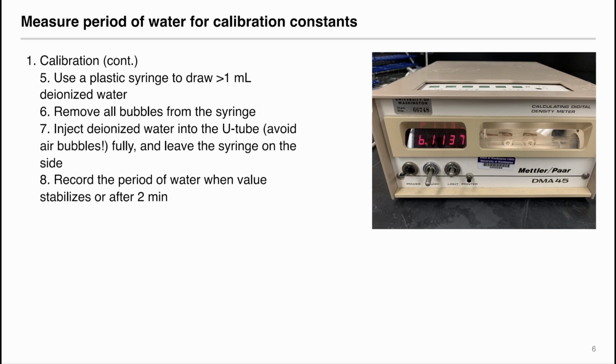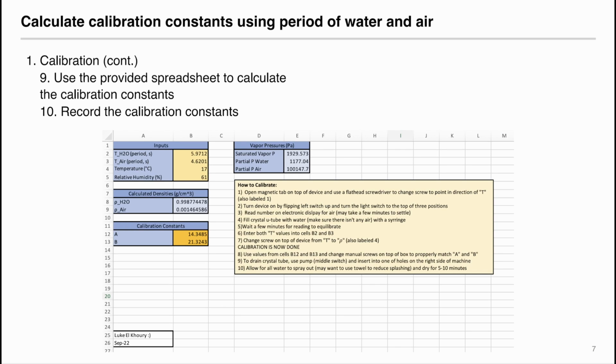Then record the period of water when the value stabilizes or after 2 minutes. The value here reads 6.1137 seconds.